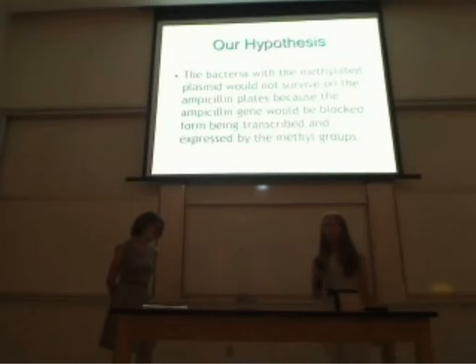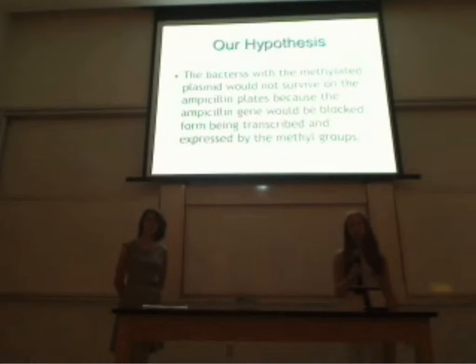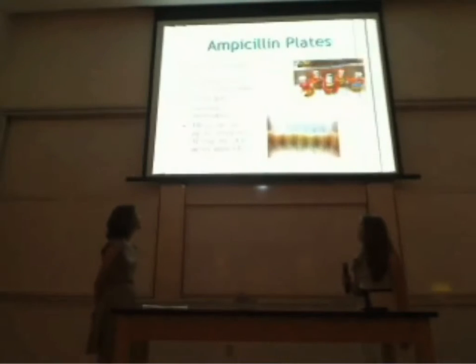So our hypothesis for this was that the bacteria transformed with the methylated plasmid would not be able to grow on the ampicillin plates because the gene for ampicillin resistance would be blocked by the methylation.